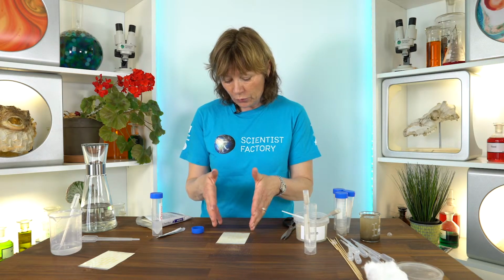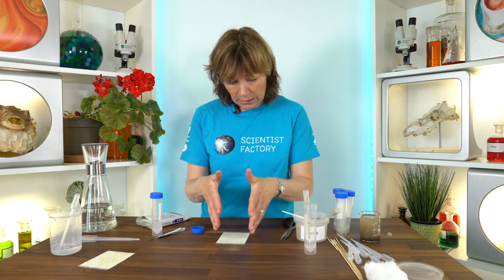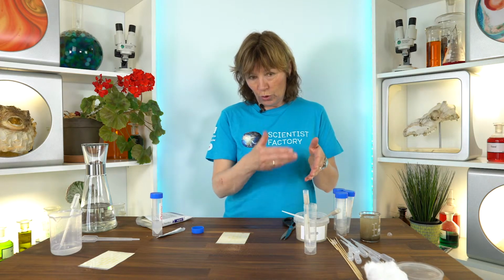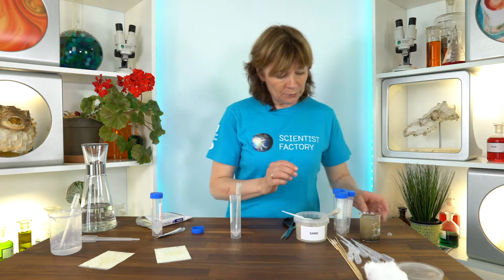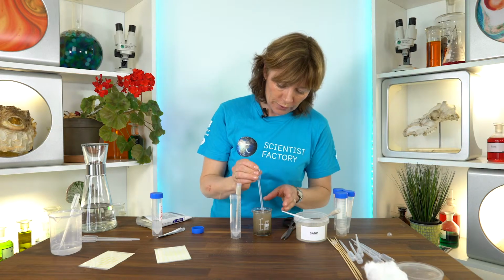Because then they have all seen how to put the water on the film. And then you make the column together, and then you can let them loose, or you can guide them through the whole experiment. And now I will start by adding dirty water on the top of this column.